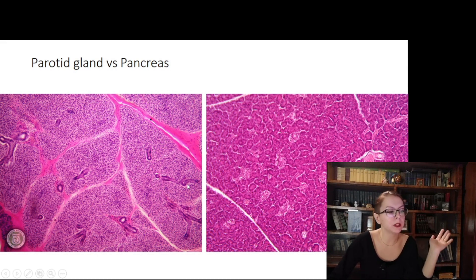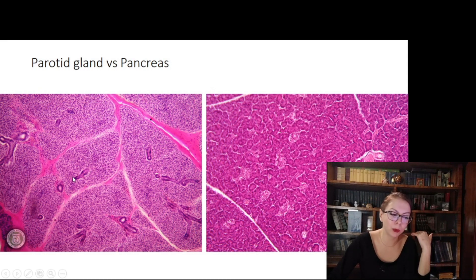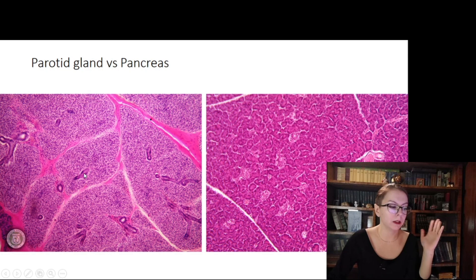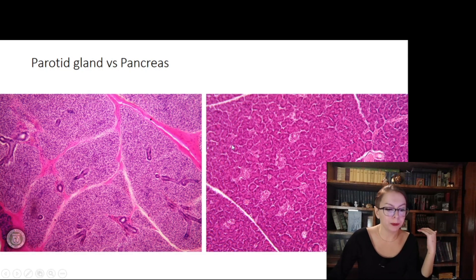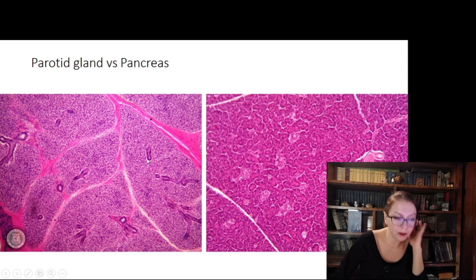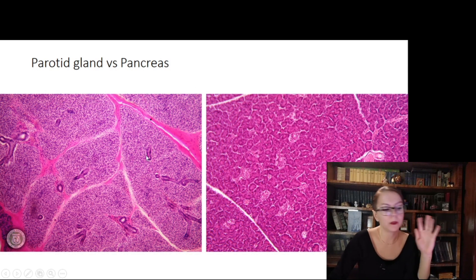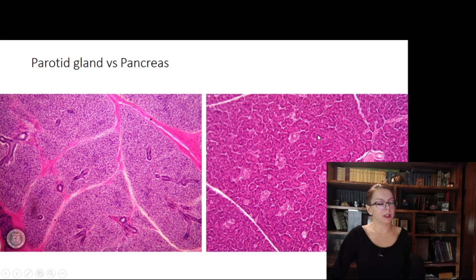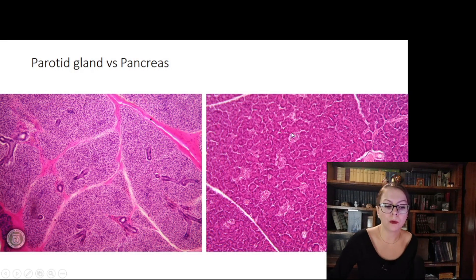Striated ducts are present in the parotid and absent in the pancreas. They are very prominent at different magnifications — both large and small. So if you see striated ducts, this is the parotid; if they are absent, this is likely the pancreas.